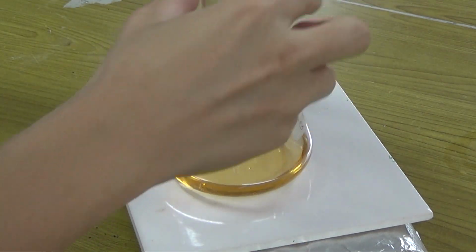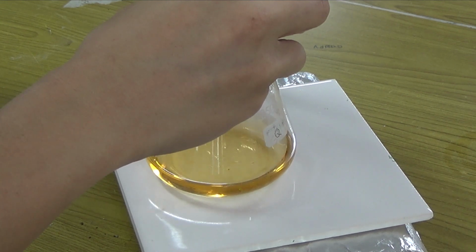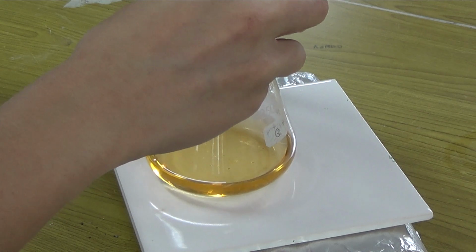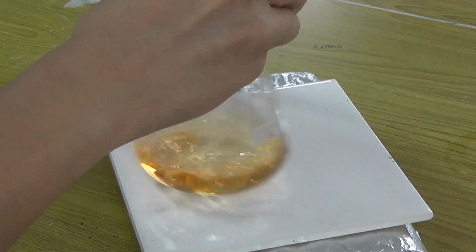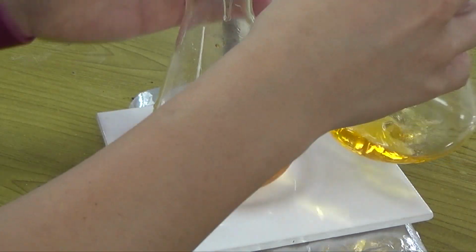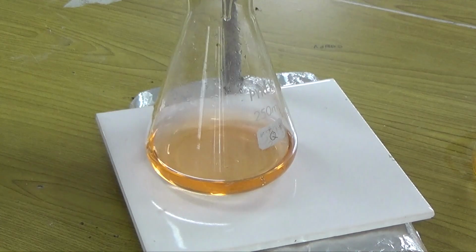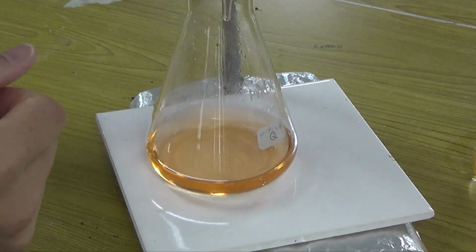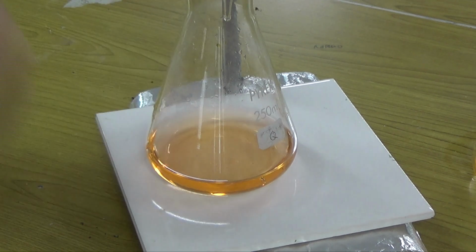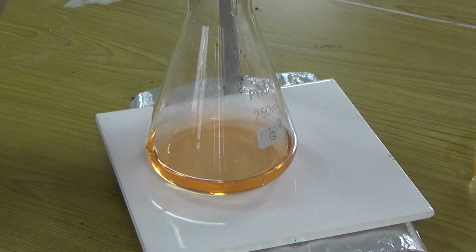So notice the color. I already saw it change because it's easier on the eye than perhaps with the video camera. So I'm just going to add one more drop and see what happens. It's pretty much still the same color, but of course if I add more and more, it's going to go beyond the yellow, orange, to the pink. But the moment when it changes color, there's a sharp end point. You shouldn't be too far from my exact titer if you're my students, because your result will be marked based on your teacher's result. So make sure you check with the teacher, right?